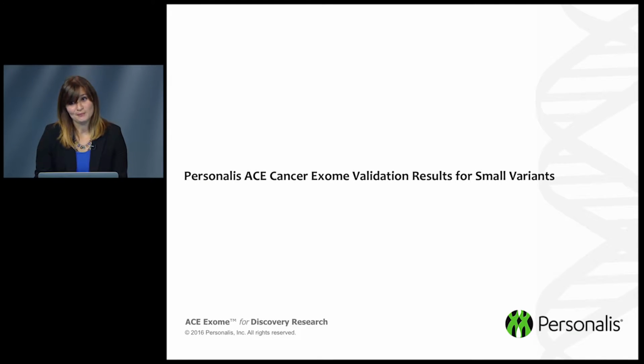So accuracy is very important to us, as I hope I've made clear by now. In order to assess the accuracy with which we call somatic variants using our assays, we conduct rigorous analytical validation studies to determine our limits of detection. So for the sake of time, today I'll briefly describe our strategy and results from just one of our validation studies, our ACE Cancer Exome tumor-normal workflow.